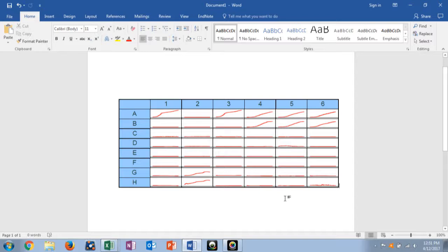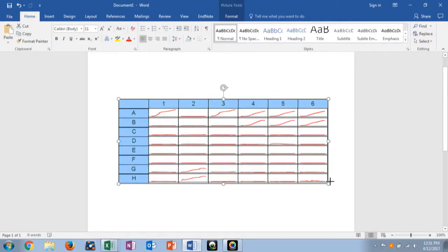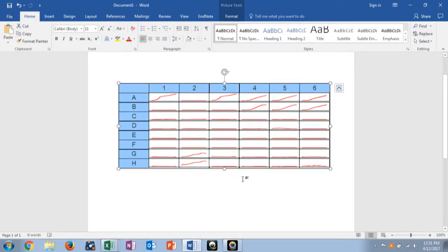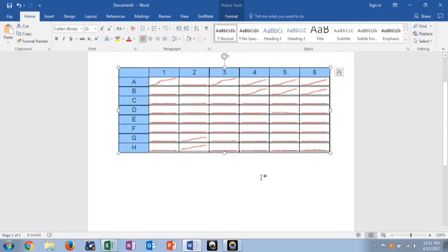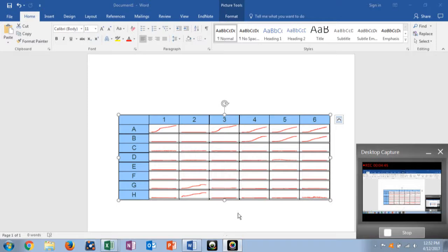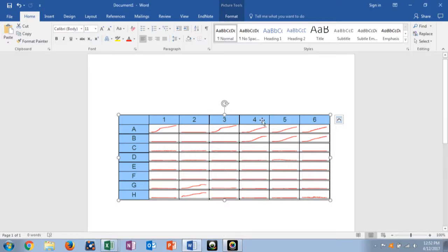Alright. So if you paste it as a picture, it comes out not looking absolutely terrible. And then you can actually work with it. So let's see, will this allow me to write on here? No, okay, just recording.